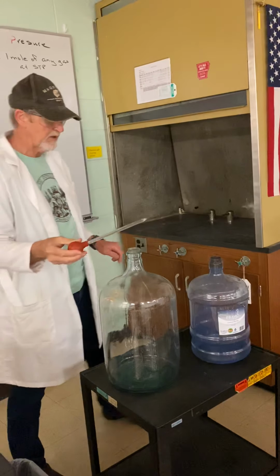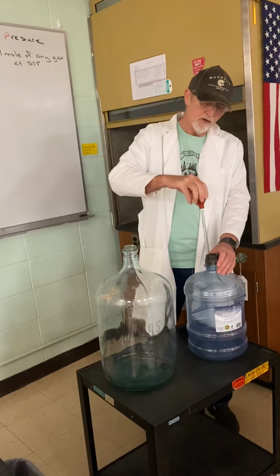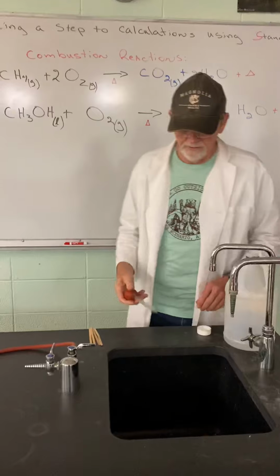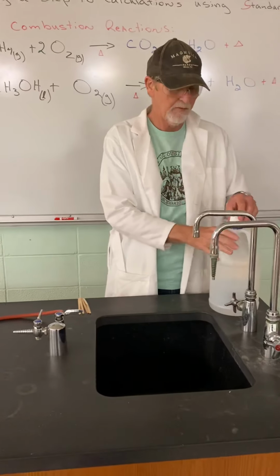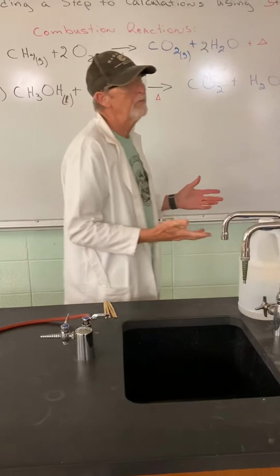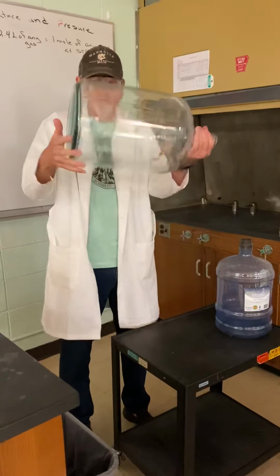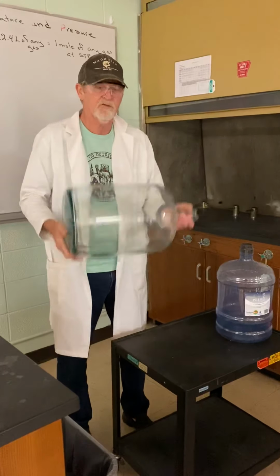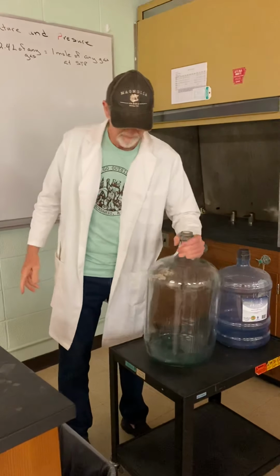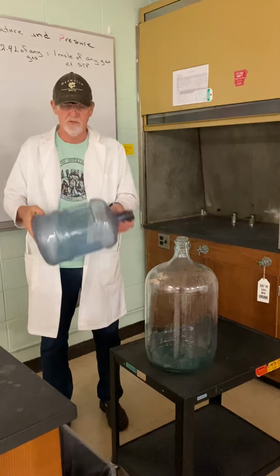So we got approximately the same in both, fairly close. I'm going to close this up. Now, I'm going to let it mix for a few minutes because we want to create a fuel mixture, letting it surface around on the inside. And then do the same thing with this one.